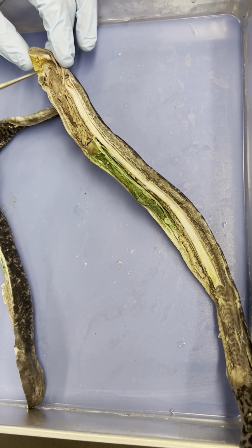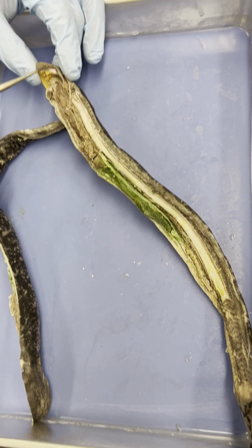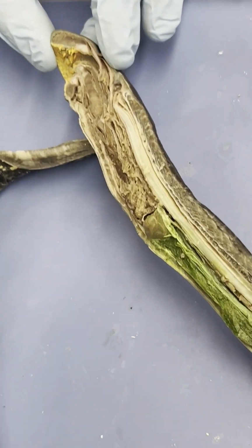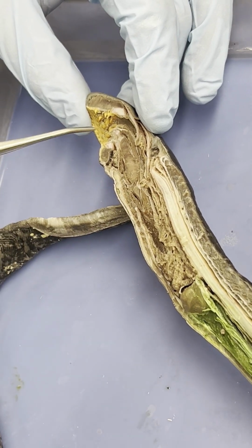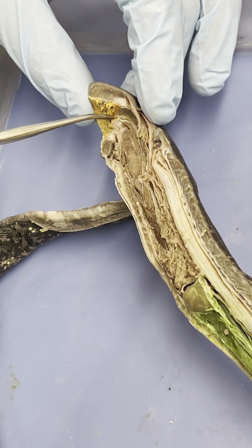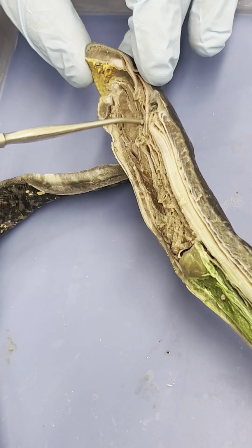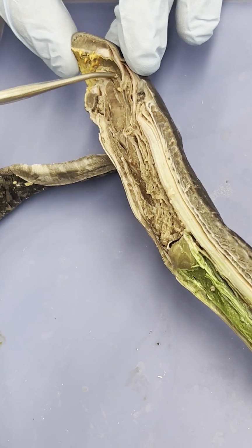So here's the opening right here of the mouth, essentially. Here we actually have some buccal muscle helping this lamprey latch on to whatever host fish or rock that it can latch on. So if we go down this buccal funnel or the buccal cavity a little bit, we're going to run into the pharynx, kind of right into this area right here.